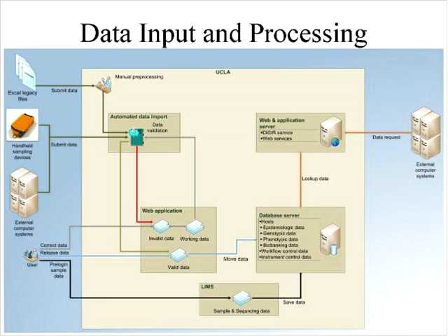And we have worked very closely with the systems integrators that are providing those automated systems to make sure that the technology and the web systems that they're developing in order to control all the pieces of instrumentation within an individual automated system also allows for that integrated system to communicate back to our LIMS system. So a really important concept within this laboratory has been defining a consistent set of specifications for information technology for all of the automated systems to ensure that we will be able to integrate them all together into one system.